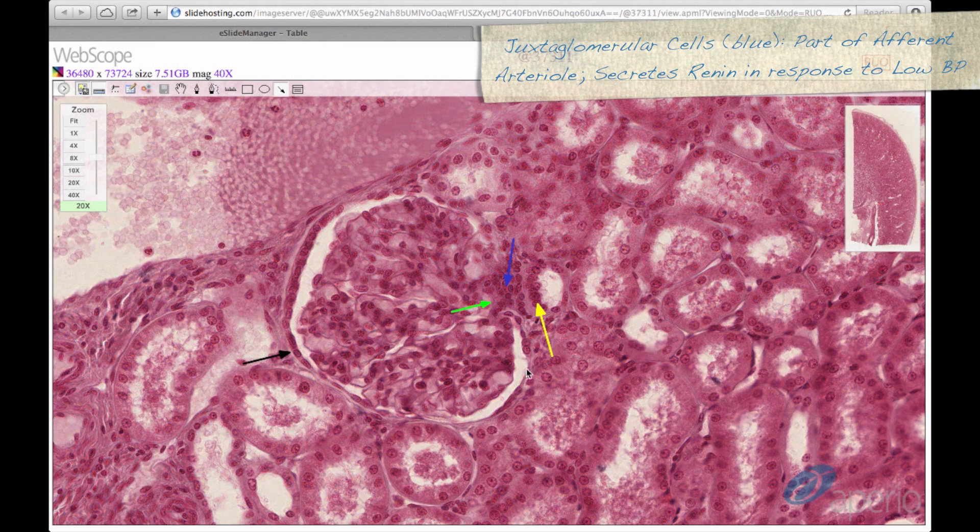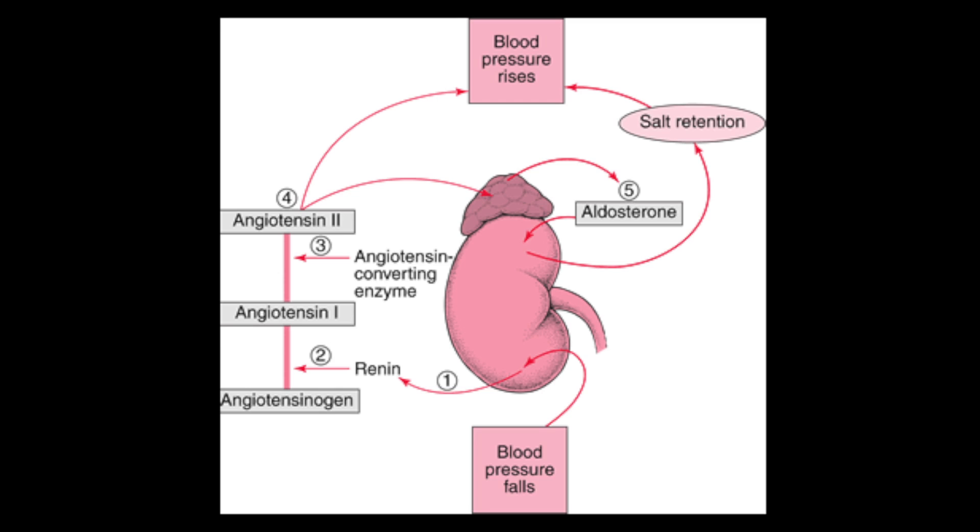We can also see juxtaglomerular cells, a portion of the afferent arteriole here at the blue arrow. Juxtaglomerular cells are responsible for the production of renin in response to low blood pressure. Renin converts angiotensinogen to angiotensin 1. Angiotensin 1 then passes through the heart and lung where it is converted to angiotensin 2 by ACE or angiotensin converting enzyme. Angiotensin 2 then causes the release of ADH and aldosterone, which act at the distal convoluted tubule and collecting duct to increase water absorption.